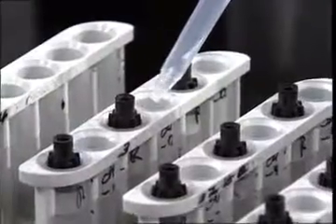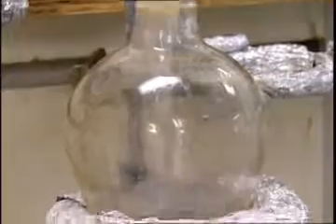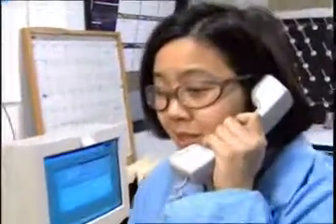As we succeed in hazardous waste minimization, the waste management burden decreases. The whole lab runs more efficiently. Time and money are saved, and the likelihood of emergencies goes down. Our jobs get easier, and the real bottom line winner is the environment.